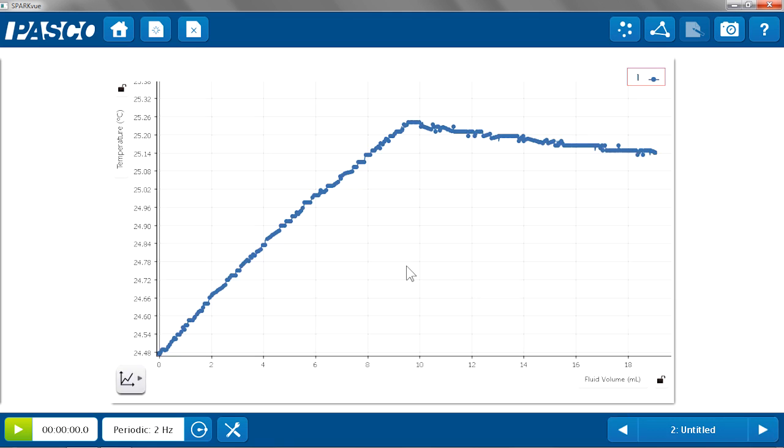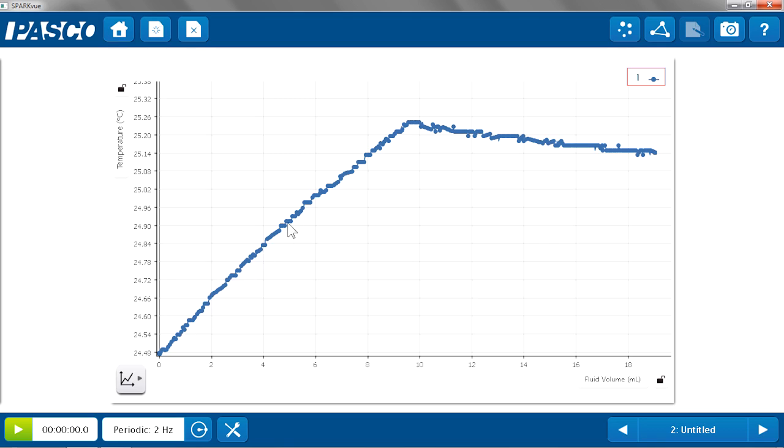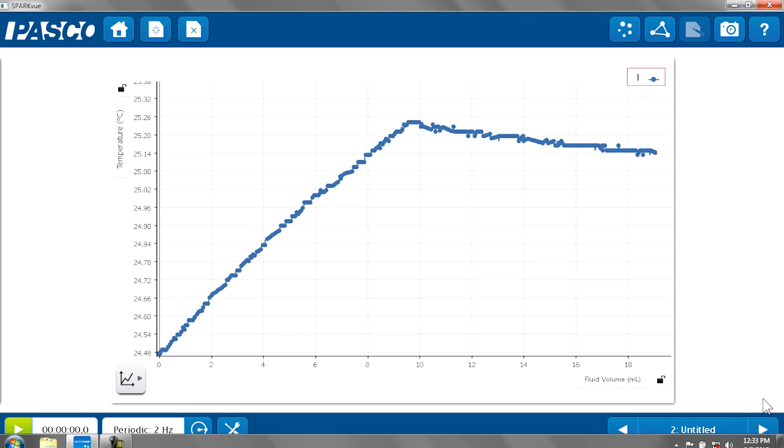So, now we can see this is an exothermic reaction. And it can tie in thermochemistry and acids and bases. The reaction kept heating up, giving off heat, until the equivalence point was reached. And then the temperature started to go back down, as I just essentially was diluting the titrant that I added. And I can also look at the conductivity.